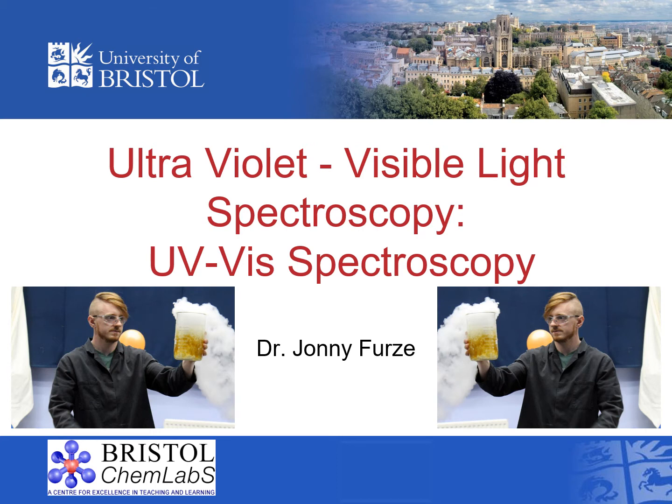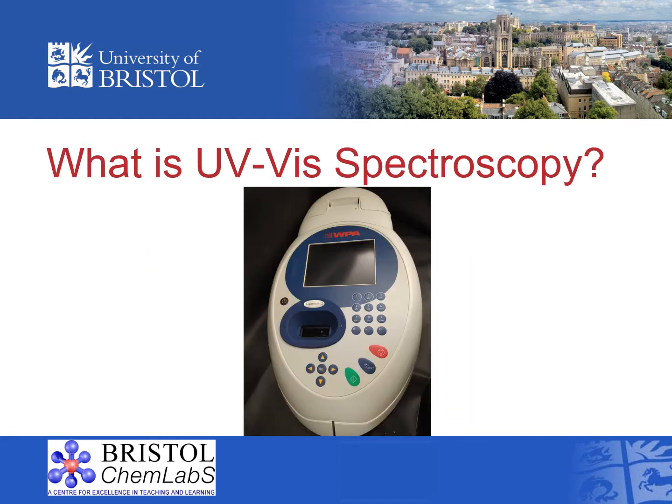I'm going to give you a short introduction into ultraviolet visible light spectroscopy, or UV-Vis spectroscopy, and explain and then demonstrate how a UV-Vis machine works. So what is UV-Vis spectroscopy?